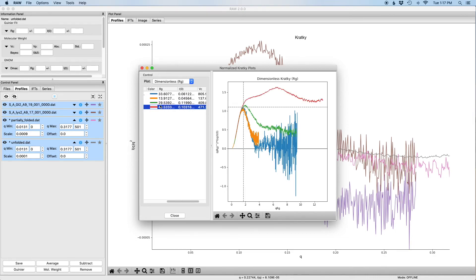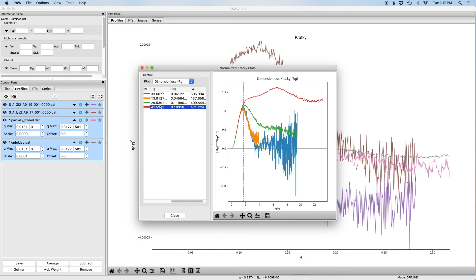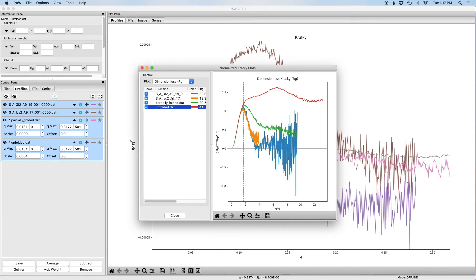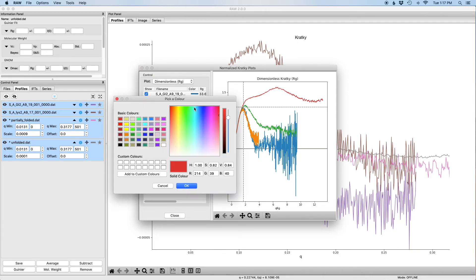If you scroll over in the window, you can see the rg and I of zero values that are being used. Finally, if you click on these colors, you can change the color of the line that's being plotted if you want.